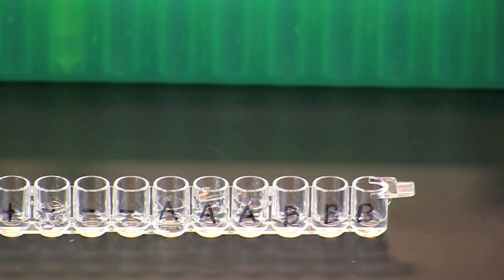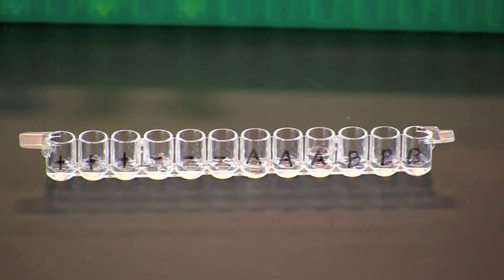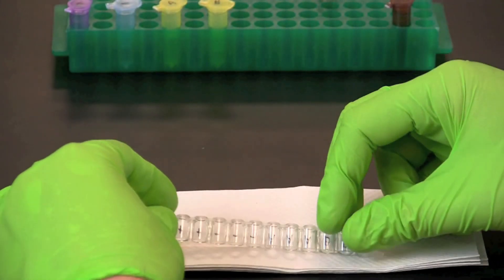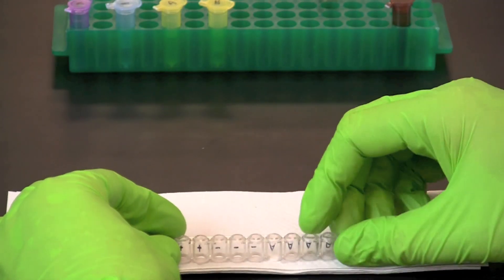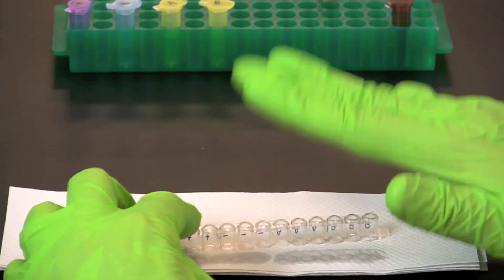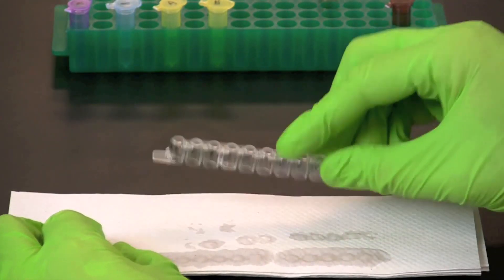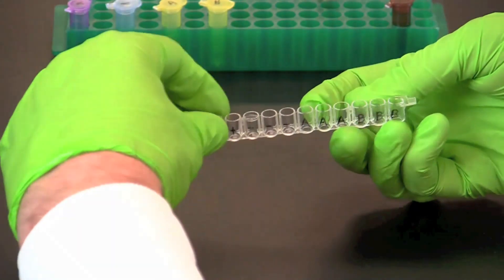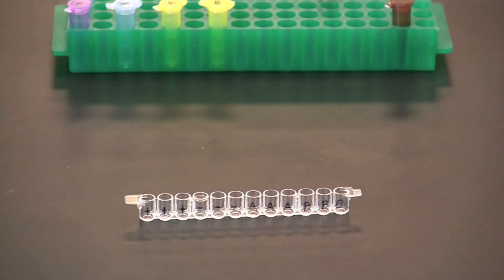Incubate the samples at room temperature for five minutes so that the secondary antibodies can bind to the serum antibodies. Tip the microplate strip upside down onto a short stack of paper towels and gently tap the strip a few times to empty the wells of secondary antibody. At this point, repeat the wash procedure using wash buffer three times.